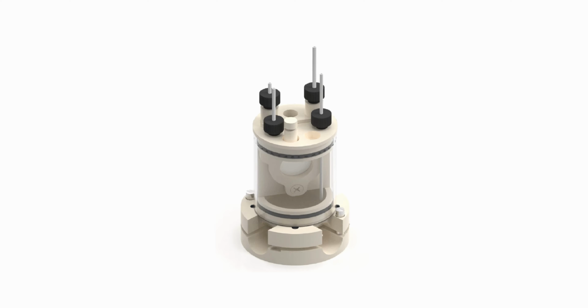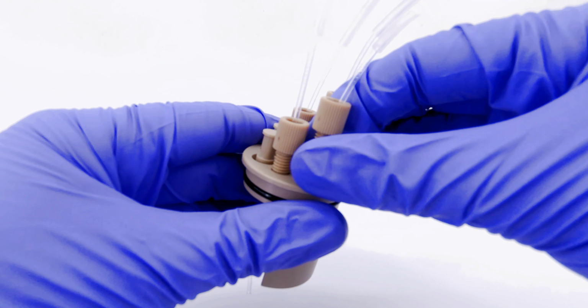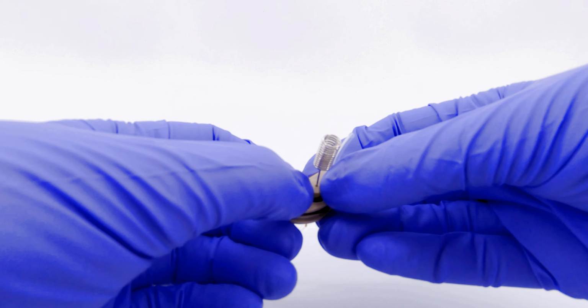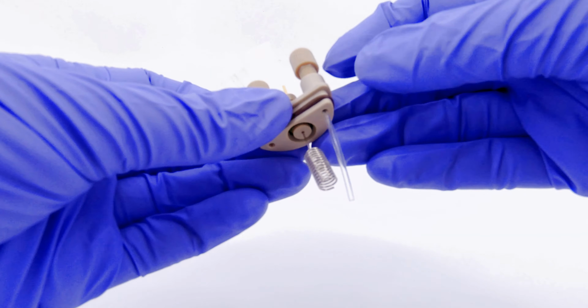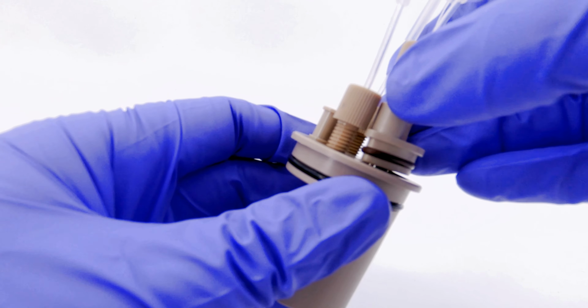Let's now shift gears to the bottom mount H cell. Since the working electrode assembly remains the same, let's focus on the lid. Grab the second lid and position the counter electrode, pushing down firmly with your thumbs to guarantee a tight seal. Then, return the second lid back into the primary one.